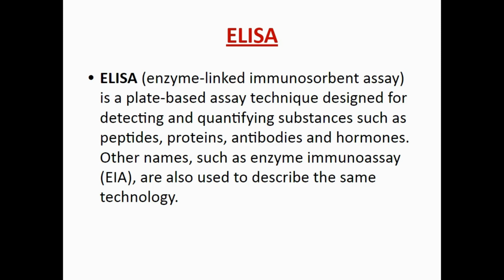ELISA is a commonly used analytical biochemistry assay. The assay uses a solid phase enzyme immunoassay to detect the presence of a ligand, commonly a protein, in a liquid sample using antibodies directed against the proteins to be measured. ELISA has been used as a diagnostic tool in medicine, plant pathology, and biotechnology, as well as a quality control check in various industries. ELISA is also commonly known as EIA, or just the enzyme immunoassay.